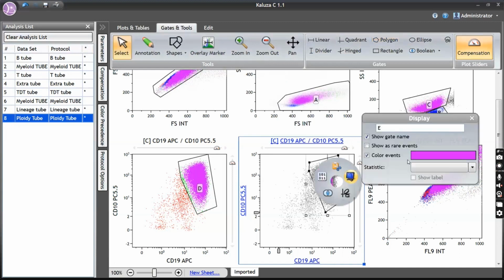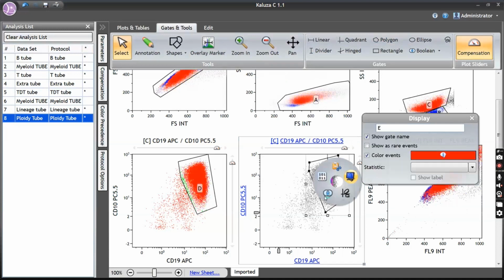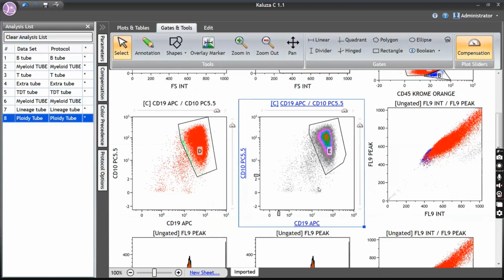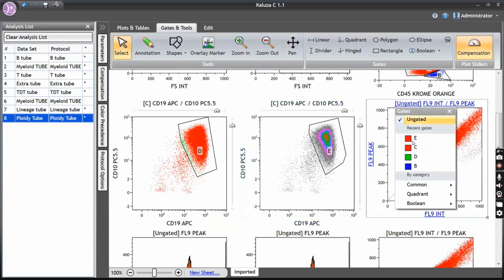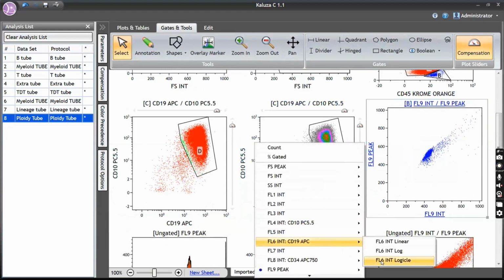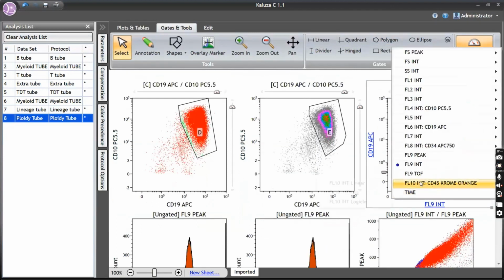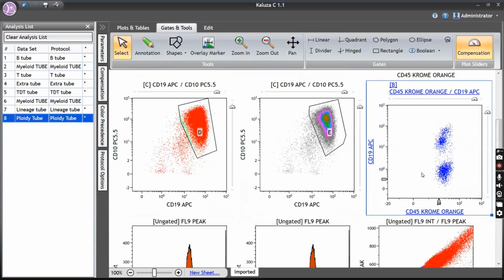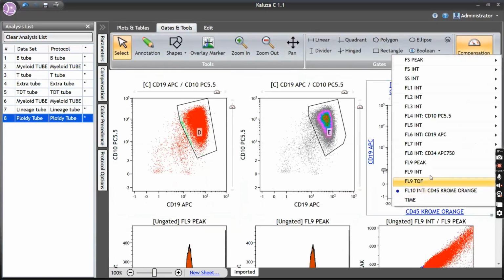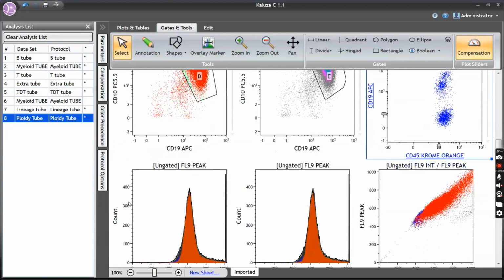Now again, lymphocytes you need to refine because this is a very sensitive experiment, doing ploidy. So you need to again refine your lymphocytes. So drop the lymphocyte population here. Select 19, along with some CD45. I may use CD7 also sometimes, but here it's not there, but still okay. So mostly it looks fine.